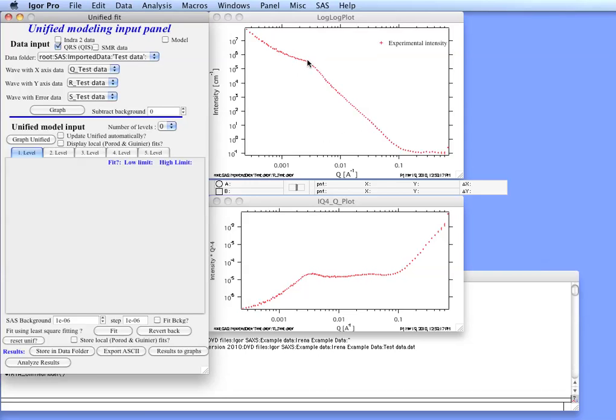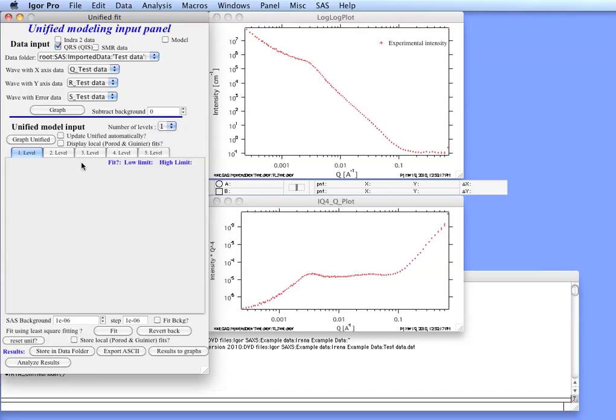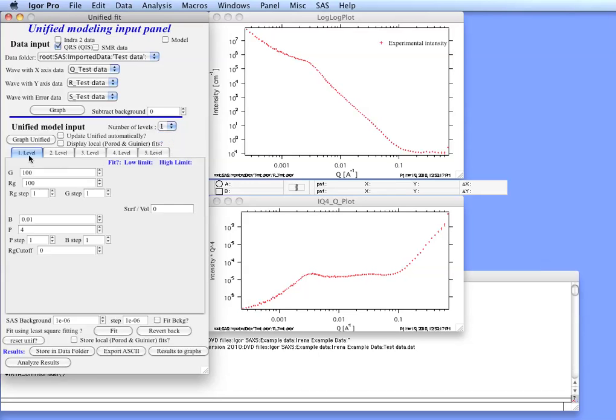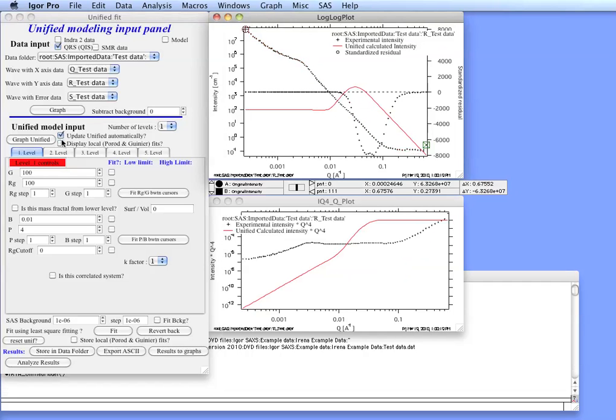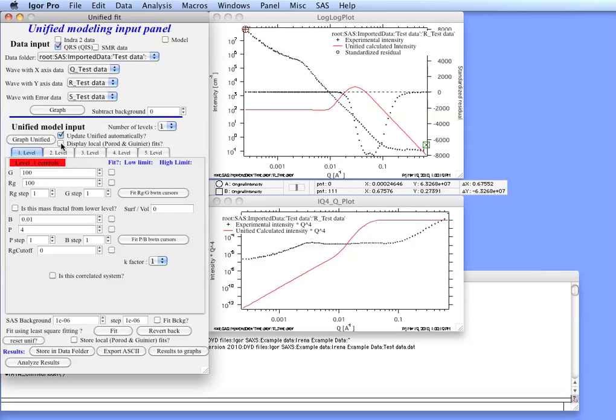Second level these, and the third level which you see will represent the larger stuff. So let's first start with level number 1. Select level 1. And click on the tab, level 1. You can also check update Unified automatically and display local fits. That will be helpful for the fitting.